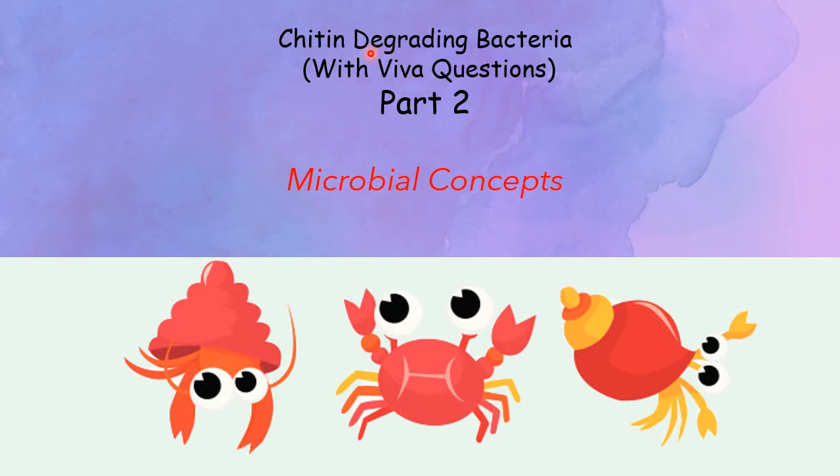So first, to study that particular chitinase enzyme, we need to isolate chitin degrading bacteria, and that is the main motto of your practical. So how to proceed for such kind of isolation, where you want to see whether a particular biopolymer is being degraded by bacteria or not. So here we are going to study chitin degrading bacteria.